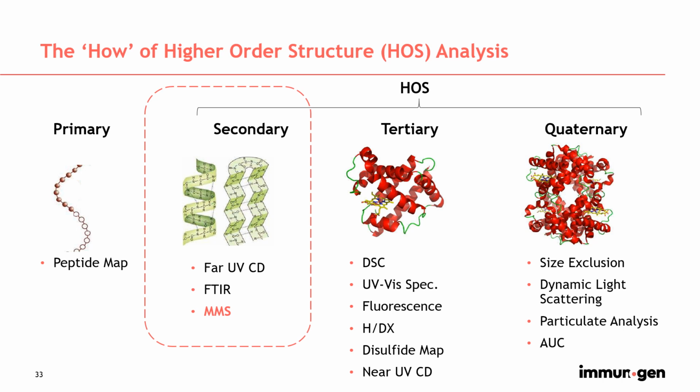For example, limited concentration ranges, requirements of high amounts of sample, incompatibility with certain buffer matrices, and more importantly, complex workflows that involve quite some hands-on time with sample prep and data acquisition. MMS provides an alternative to these two techniques while also overcoming some of those challenges.